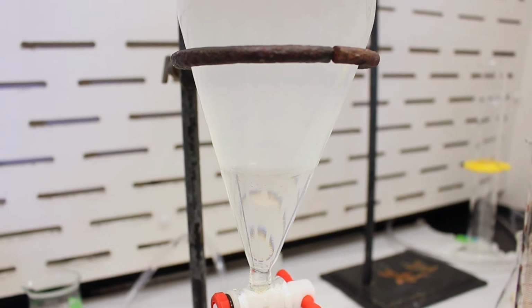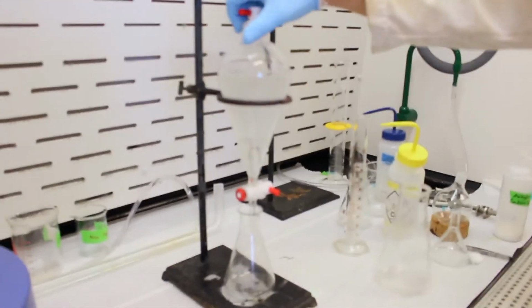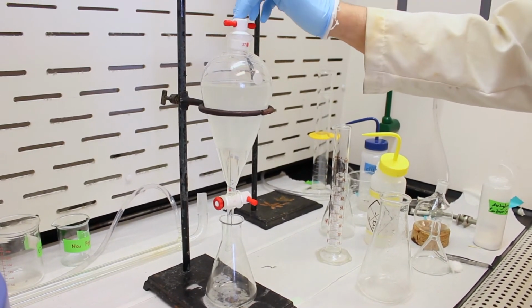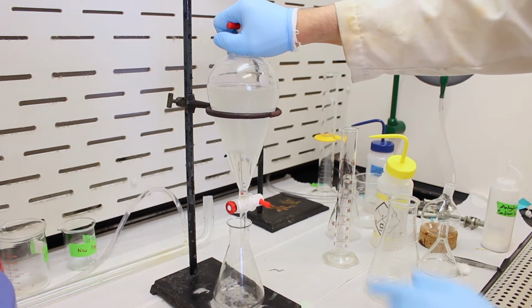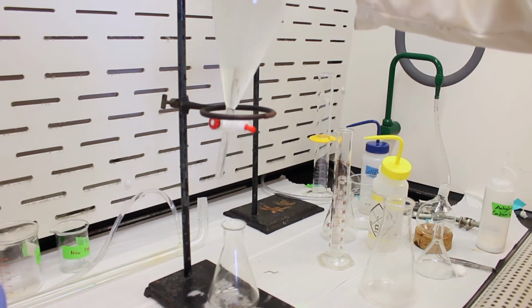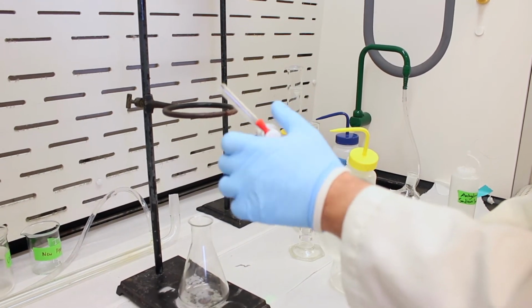So we're going to cap the separatory funnel. A lot of students think this is the most entertaining portion of the lab because it's interactive and physical. You have to get a firm grip on the stopper because you don't want it to leak. So I'll put a firm grip here, and this hand will not move. I'll raise it out of the ring and invert it. Now the first thing I'll do is vent it. And you didn't hear anything.